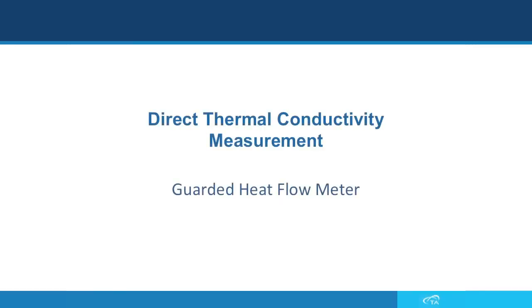In this TA Tech Tip, we are going to introduce the DTC-300 and DTC-25, which are guarded heat flow meters that measure thermal conductivity of materials directly. The Direct Thermal Conductivity measurement instrument, or DTC, is a guarded heat flow meter that can measure the thermal conductivity of a range of materials, including solids, liquids, gels, paste, and powders.